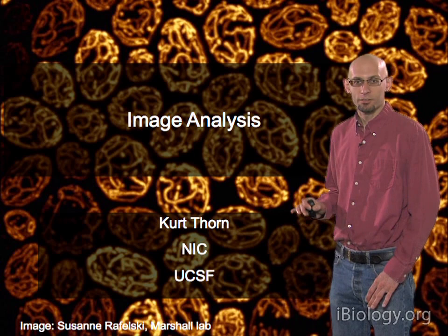Then there are filters similar to edge detection where, instead of looking for edges, you're looking for bright objects surrounded by dim objects. These are contrast enhancement filters of various sorts. Here's one where we take a very large value times the center pixel and then subtract off a small amount of information from all the neighboring pixels. There are a number of different varieties of these. They go by different names and have slightly different shapes, but they all follow this general principle of a bright central object and subtracting off its neighboring pixels.